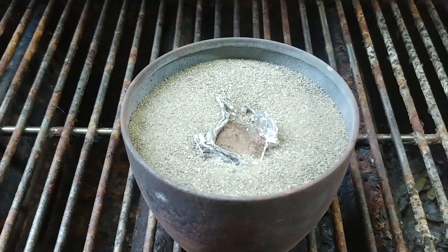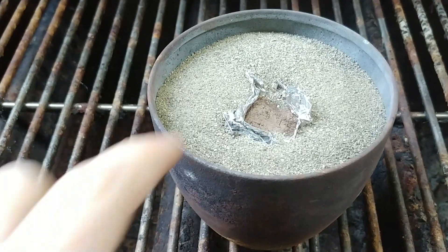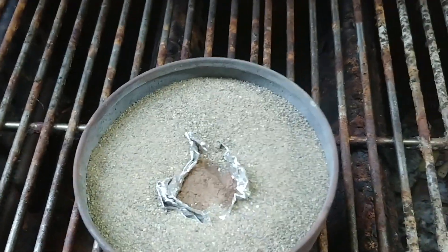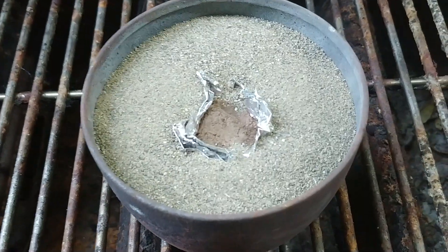Hey, welcome back everyone. Today I hopefully have a cool video. I've got 18 grams of thermite in here and then I've got a pile of packed aluminum and chromium oxide for making synthetic ruby.